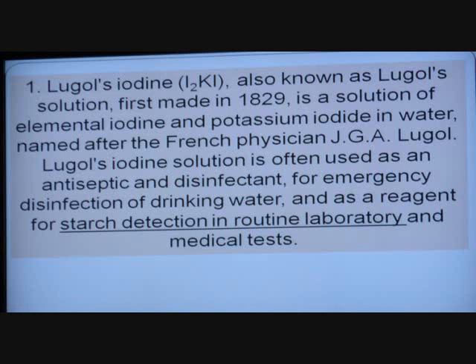But anyway, I don't know what his initials stand for. I didn't know it was I2KI. I didn't know it was Lugol. So I did a little background researching. It can be used as antiseptic when you get hurt, iodine on your lip. But it also can be used in the lab to test for the presence of starch. But it's a very good disinfectant. So if you were to be cut or whatever, you can put it on the wound and kill bacteria.